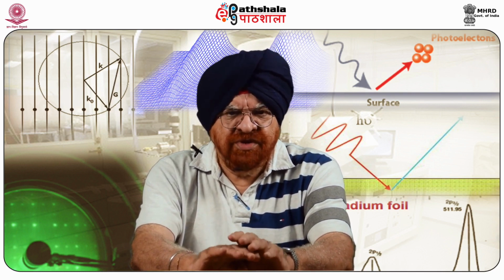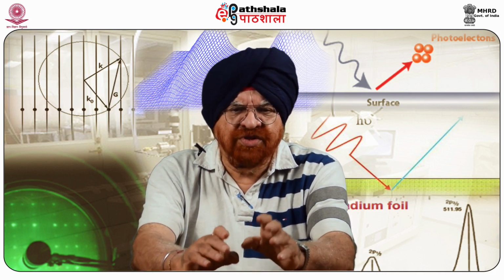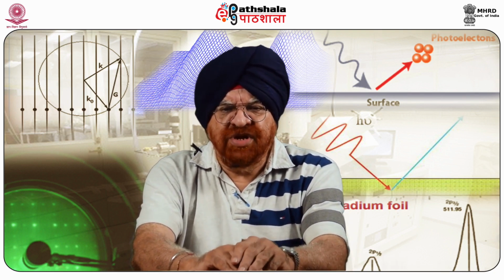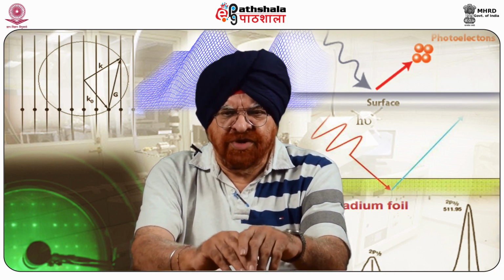These tips routinely produce high-resolution images, but are more likely to pick up surface atoms, altering the work function of the tip. Therefore, it is important that we keep it similar. Second part of this, which has been written as B here: some commercially available tips, for example, platinum iridium coated silicon cantilevers, though they are expensive, can produce sub-nanometer resolution of KPFM images.